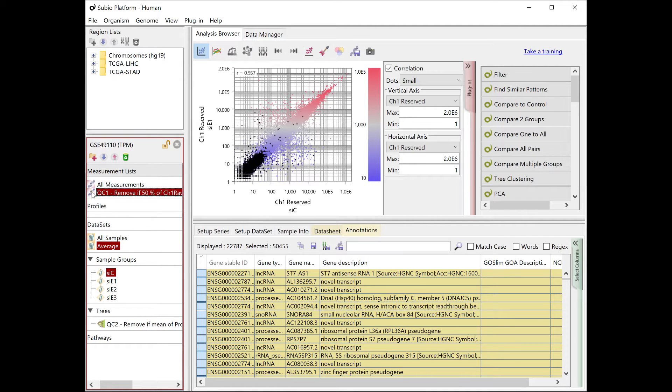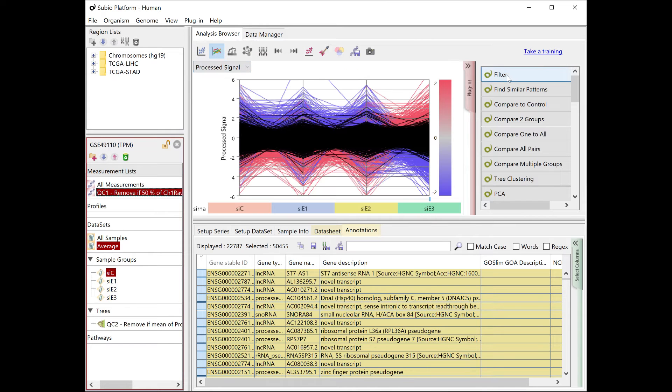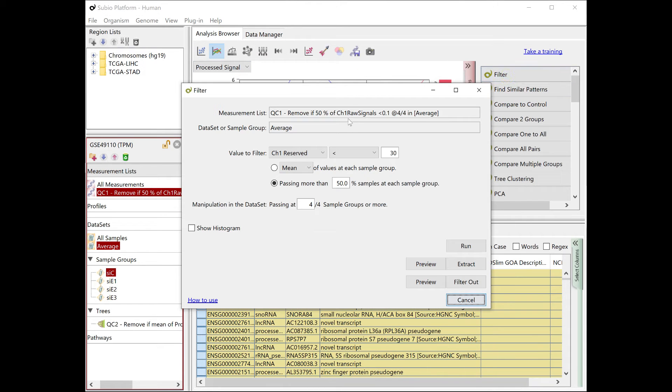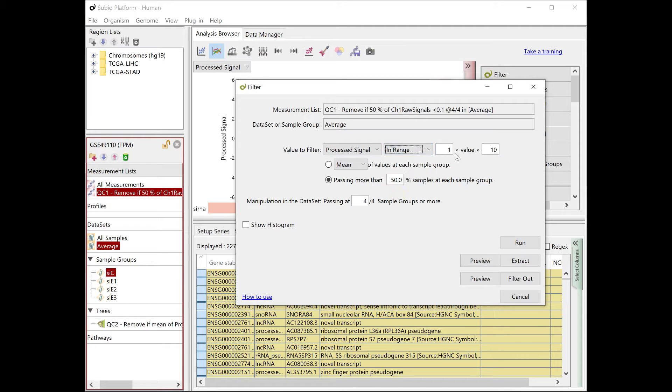Next, you are going to remove genes whose expression levels don't vary by experiment. Collect the genes whose average processed signal values fall within the range of minus 1 to 1 for all groups.